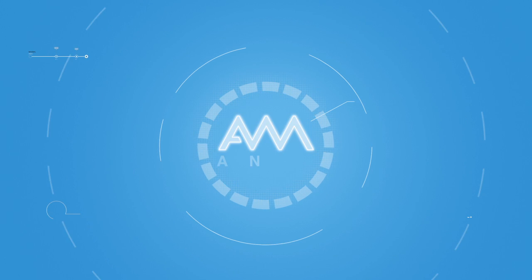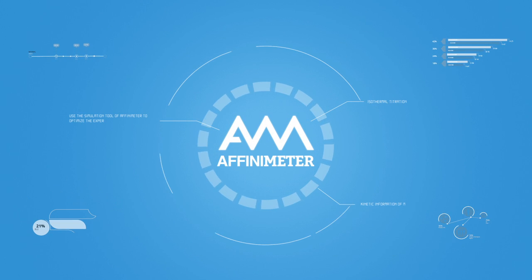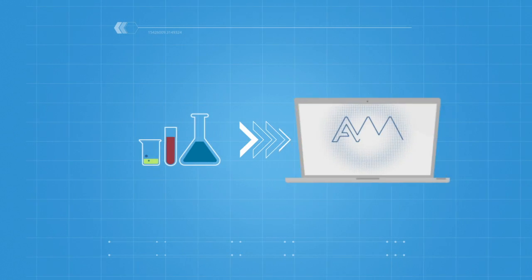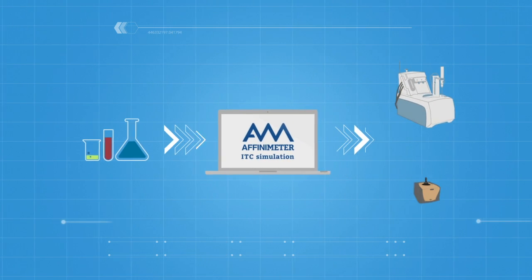Affinometer is an original software that takes the ITC technique to a whole new level. Use the Affinometer simulation tool to optimize the experimental setup for your measurements.